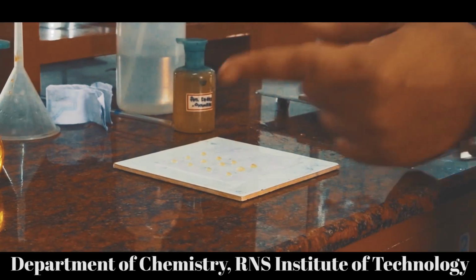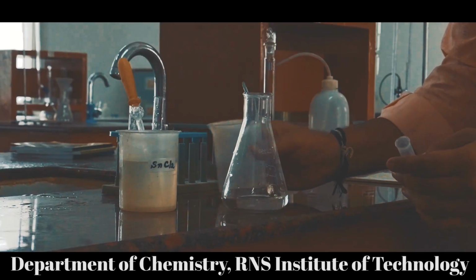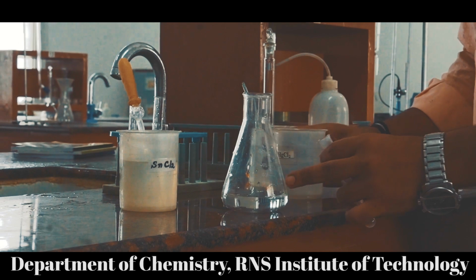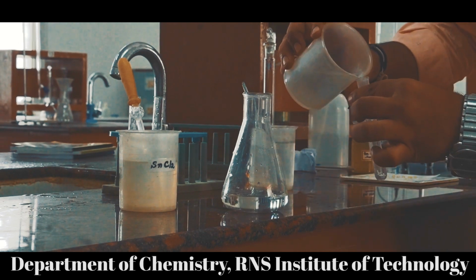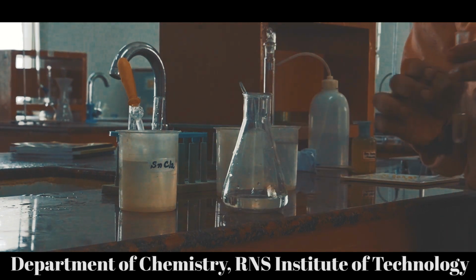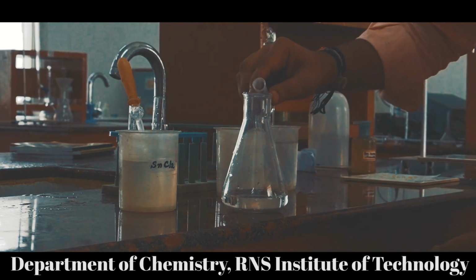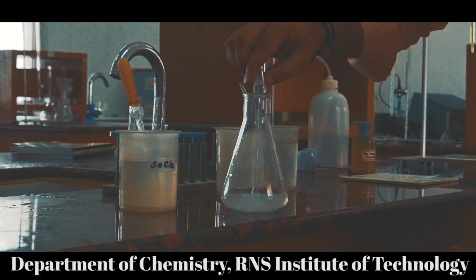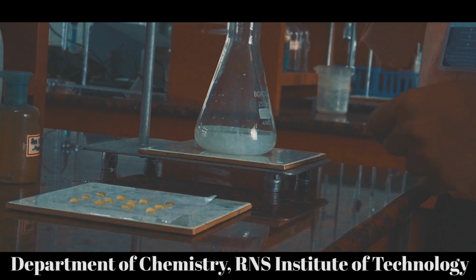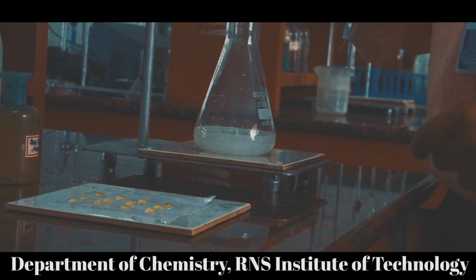We have to go for the titration. Let us add 1/4 of the mercury chloride in order to destroy excess stannous chloride. So I will take 1/4, that is up to this rubber band you have to add. Then after adding this mercury chloride, you will get a very beautiful silky white precipitate like this. So our next step is treating with potassium dichromate solution. It is an oxidizing agent.